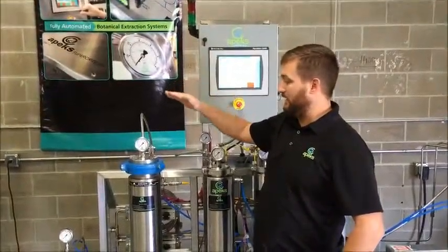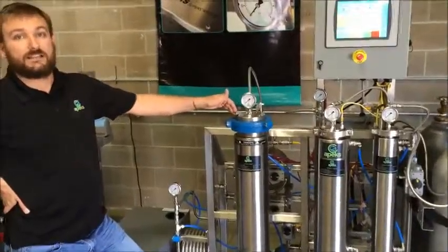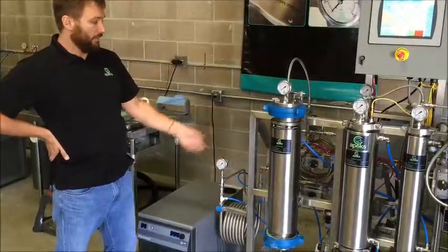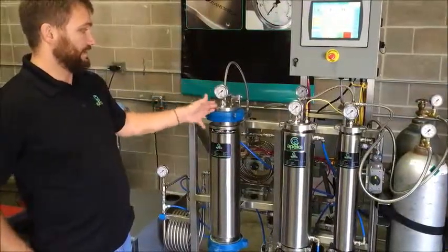You can do any combination of a 5 or a 20-liter vessel. A lot of people will start with a 5-liter vessel and then later on, if they decide they need more processing capacity, we'll add another 5 or a 20-liter vessel right here. We already have the bolt holes on the side. It's a really simple install — we'll come out and install that additional vessel whenever you're ready.